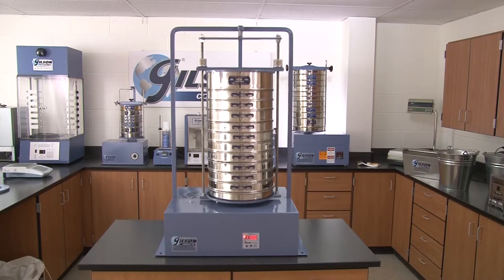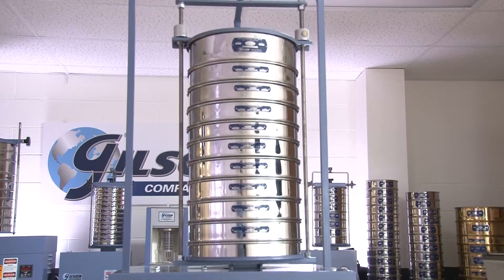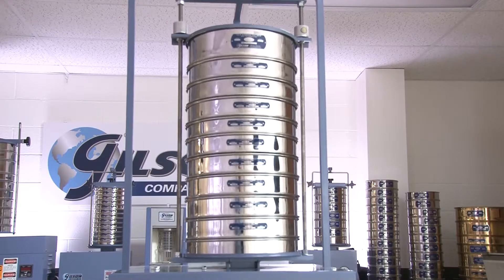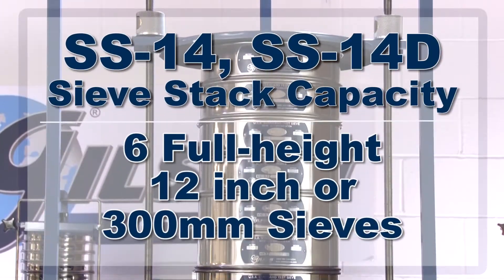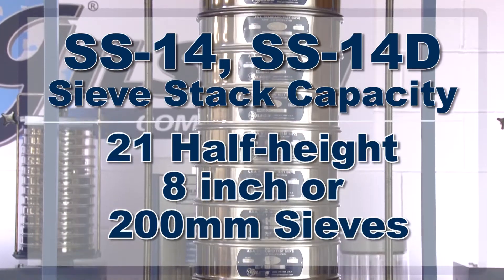With a recommended particle size range from number 4 to number 200, the Gilson SS14 and SS14D sieve shakers allow for an extended stack height during the sieving process. These rugged units can hold up to 6 full height 12 inch sieves or 21 half height 8 inch sieves plus a pan.